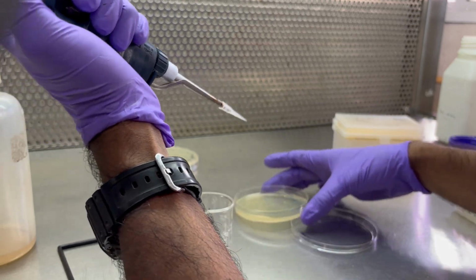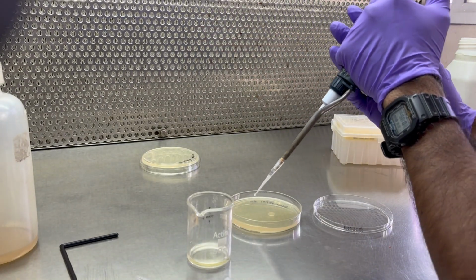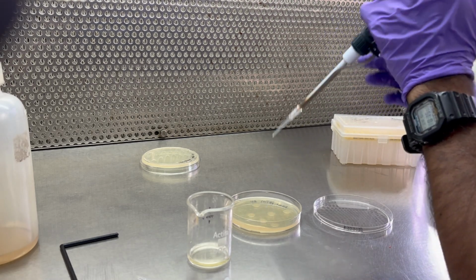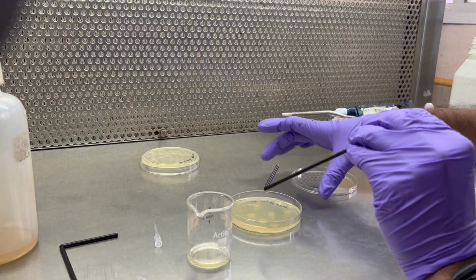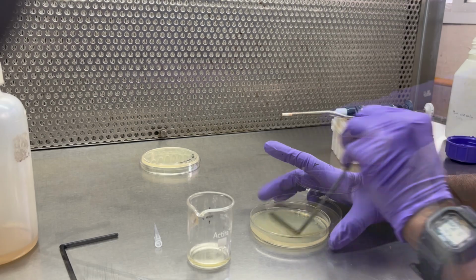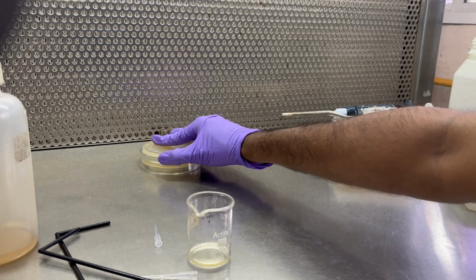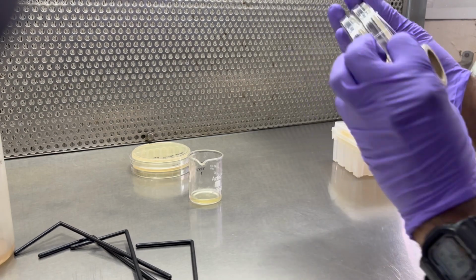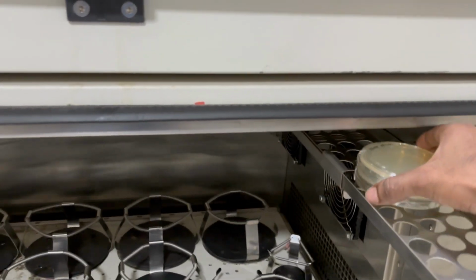Now in this case my plasmid has kanamycin resistance, and the bacteria has chloramphenicol resistance, so that's why I am plating this culture on the chloramphenicol and kanamycin plate. Spread with a sterile spreader in the laminar airflow to avoid any kind of contamination. And after spreading the culture, make sure you are sealing the plates with parafilm, and keep them again at 28 degrees Celsius for 2 days.